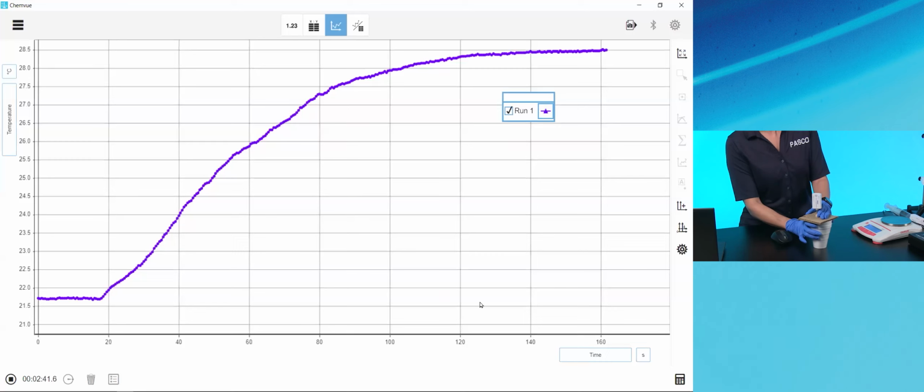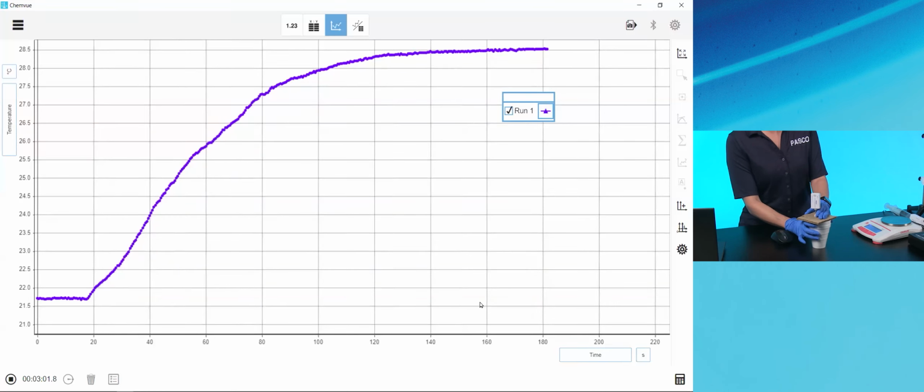So there are some things that are affecting how quickly this substance is dissolving and how quickly the energy is getting out. One of them is surface area. Now, you might have noticed that my sodium hydroxide was chunky, and the chunks were different sizes. So if I've got a few large chunks and then some powder, a mixture of those two things, I might have an error because I didn't have comparable particle size. So that might be something I decide on: do I need to fix that? And do I need to redo this run? I could use tools to decide that.